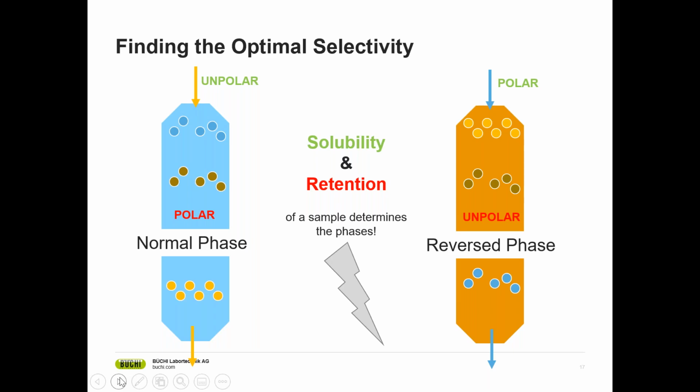In other words, you should choose the stationary phase with similar polarity characteristics to those of the sample components. For example, higher polarity of the stationary phase will increase the selectivity of the cartridge for the polar components in the sample. But when the solvent modifications don't help on a seemingly adequate phase, the only solution is mostly to go for another stationary phase.